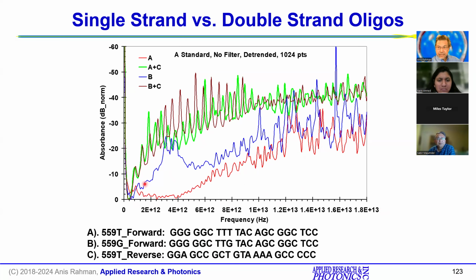because it's much heavier now and different constituents are there, the signature is quite different from the single-stranded ones, which makes sense and is expected. The key would be that if we can reproduce this experiment over and over again and learn what these peaks mean, then we can use them as a signature.